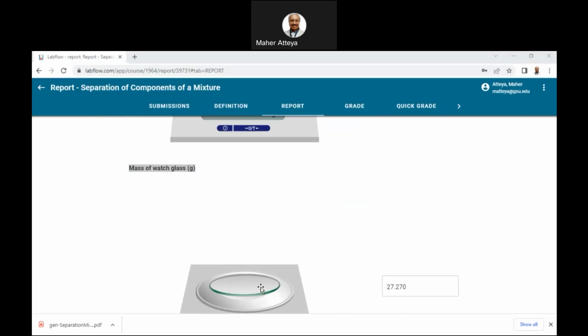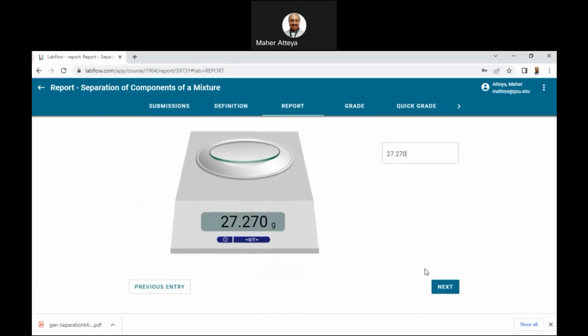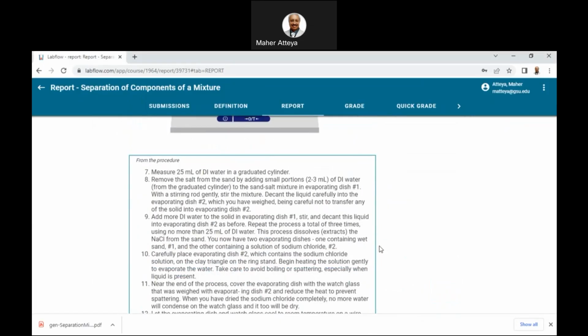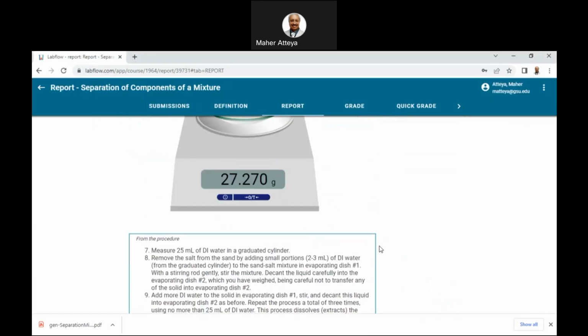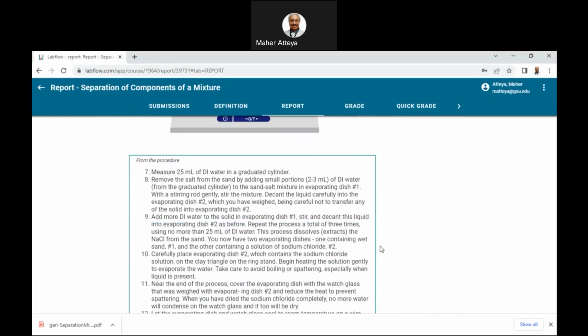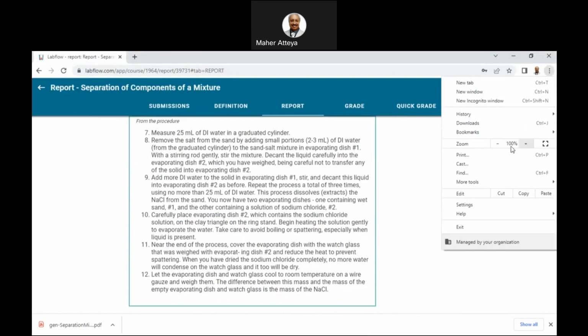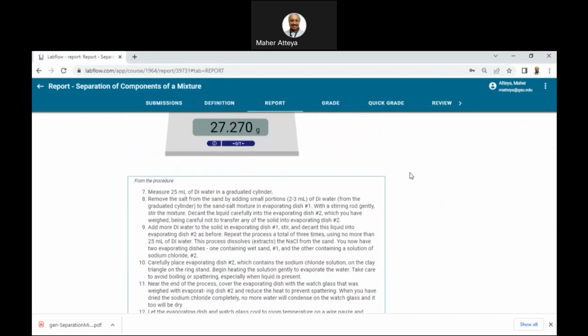Here it is saying blue. You can see it is running in blue, so we have to look at why it is blue. We did not have this. Now we will maybe have to minimize this so I have it all in one.